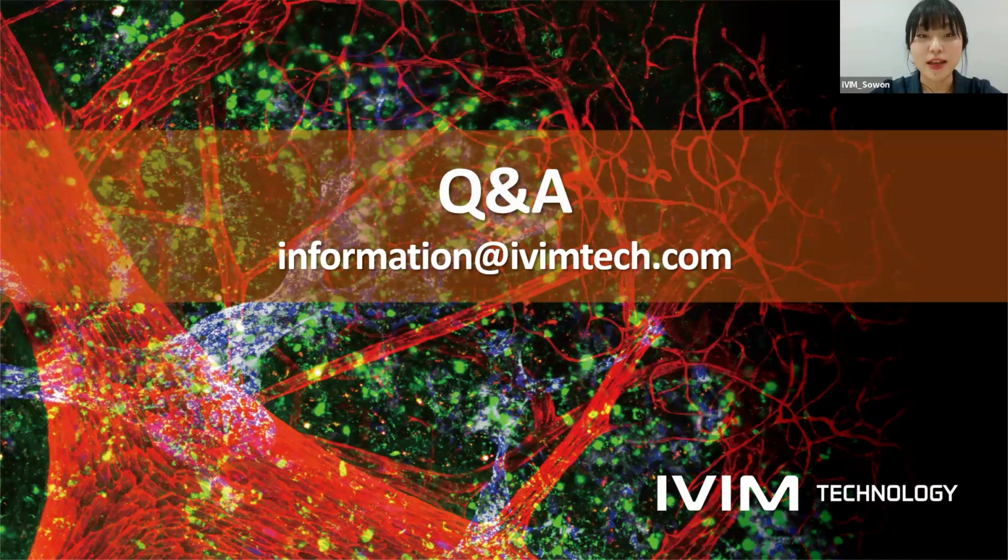Okay, thank you. And Jenny, there's one more question. So is it a confocal or two-photon system? What are the working distances? So our system has both a confocal and a two-photon laser incorporated into the system. The main difference would be for the two-photon laser, we have a fixed laser system, which is fixed at 920 nanometers. And we have another system where the two-photon is a tunable laser, so you can change the wavelength of the two-photon laser according to your research experiment conditions.